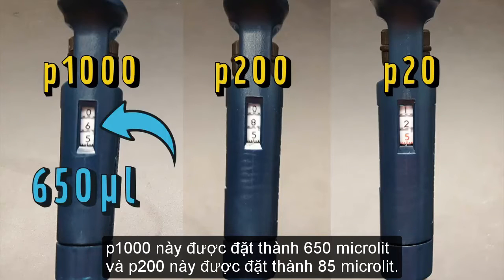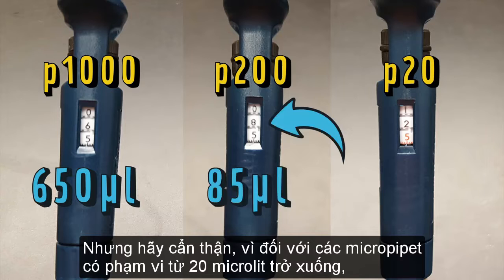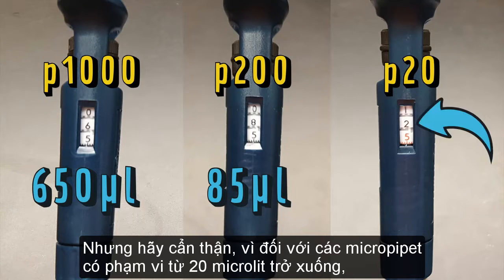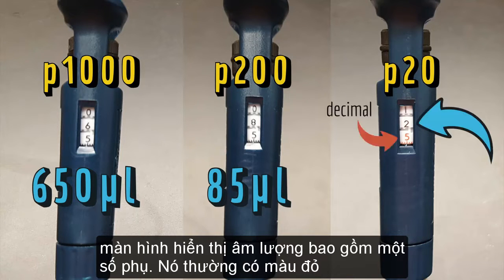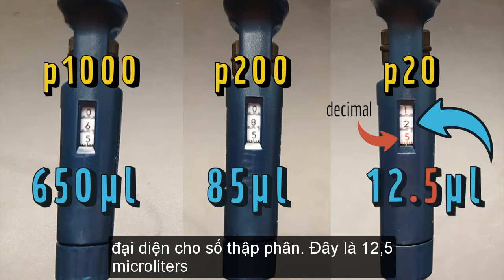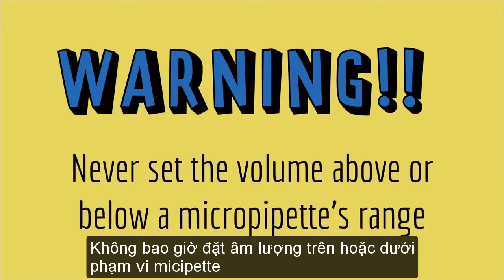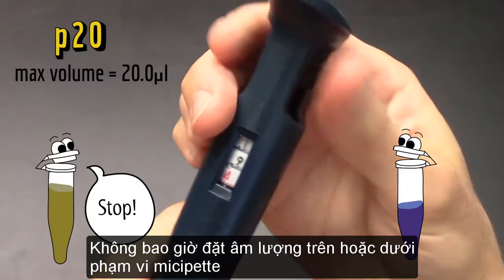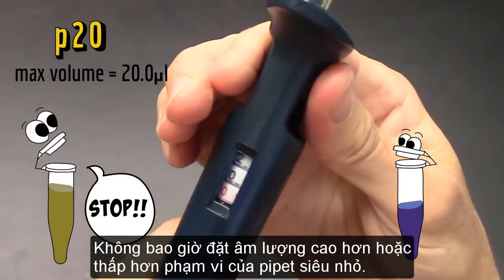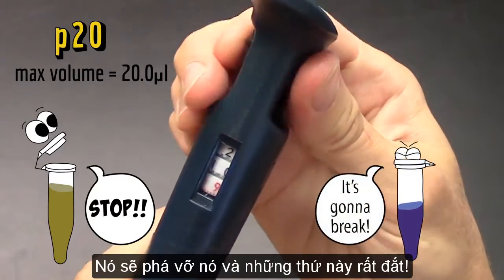So this P1000 is set to 650 microliters, and this P200 is set to 85 microliters. But be careful, because for micropipettes with a range of 20 microliters or less, the volume display includes an extra number. It's usually red, which represents decimals. This is 12.5 microliters, not 125 microliters. Never set the volume above or below a micropipette's range. It will break it, and these things are expensive.